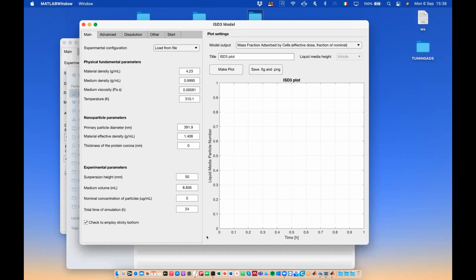I think that these data are available, but you have to be very specific about the media that you use and the amount of FBS. It has to be identical to that used in the JRC or reference protocols. Can you add to that, Ilaria?